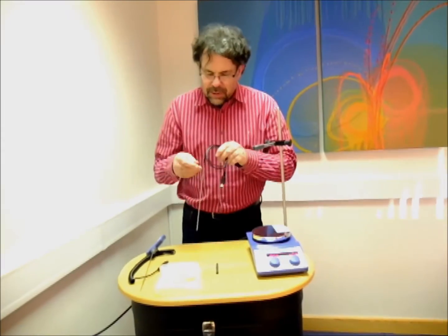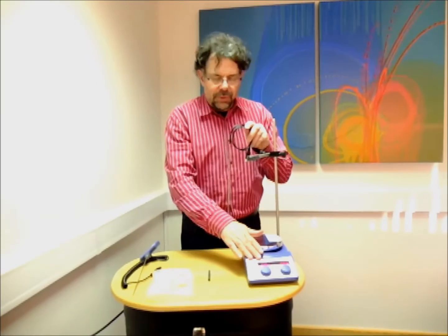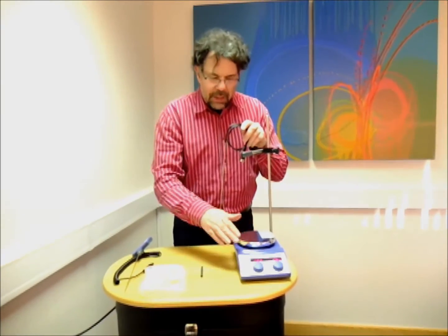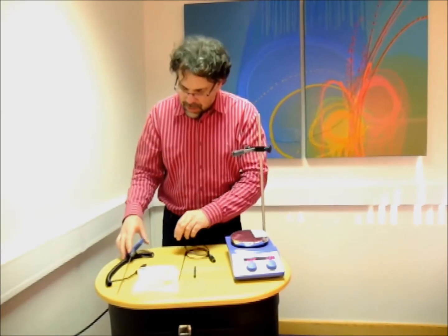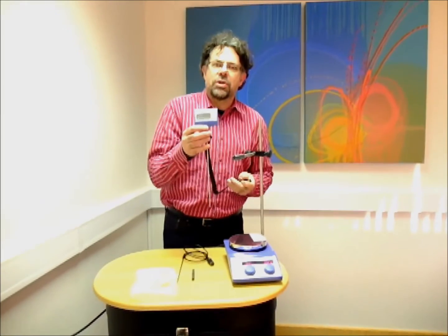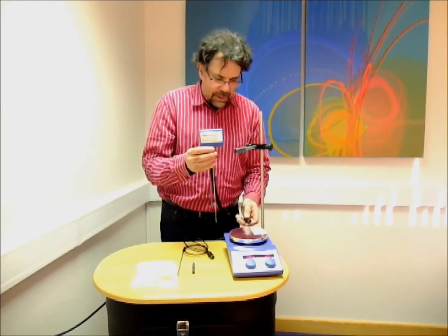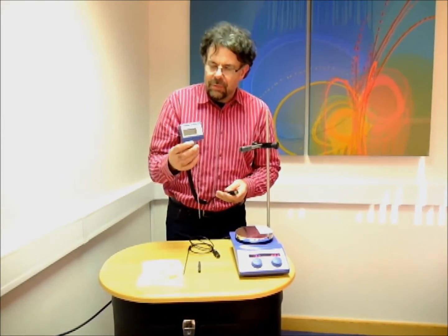We have a basic temperature probe that comes with the device, which is controlled by the two circuits within the hot plate itself, giving reasonable accuracy. But better than that, and included in the package, is this logic control temperature probe. This plugs into the back of the hot plate and offers the customer absolute control within half a degree without overshoot.